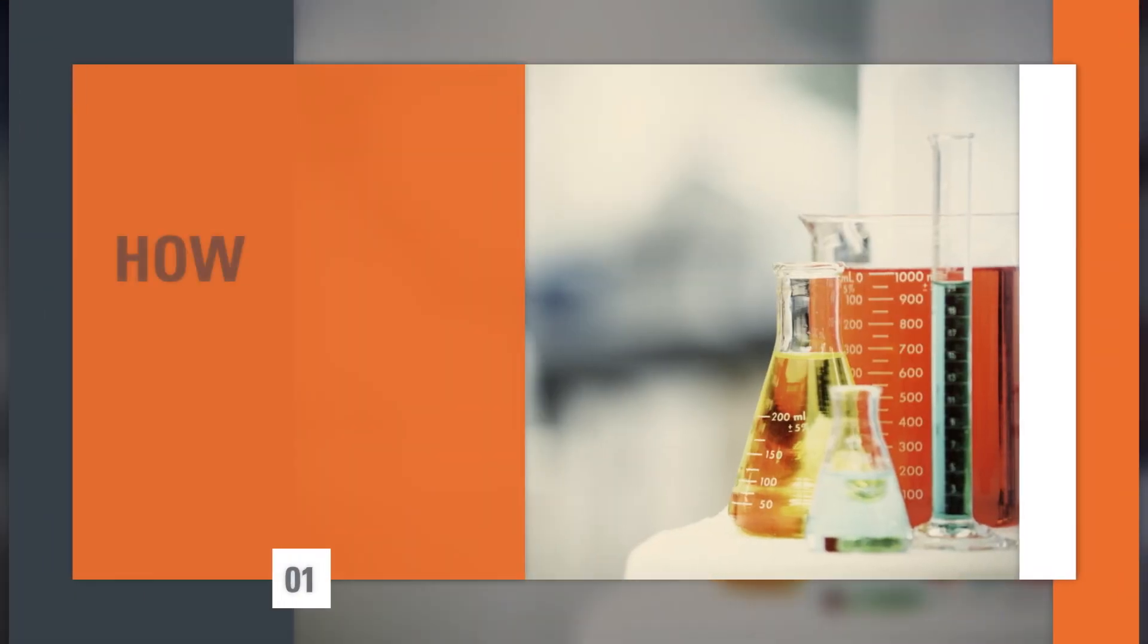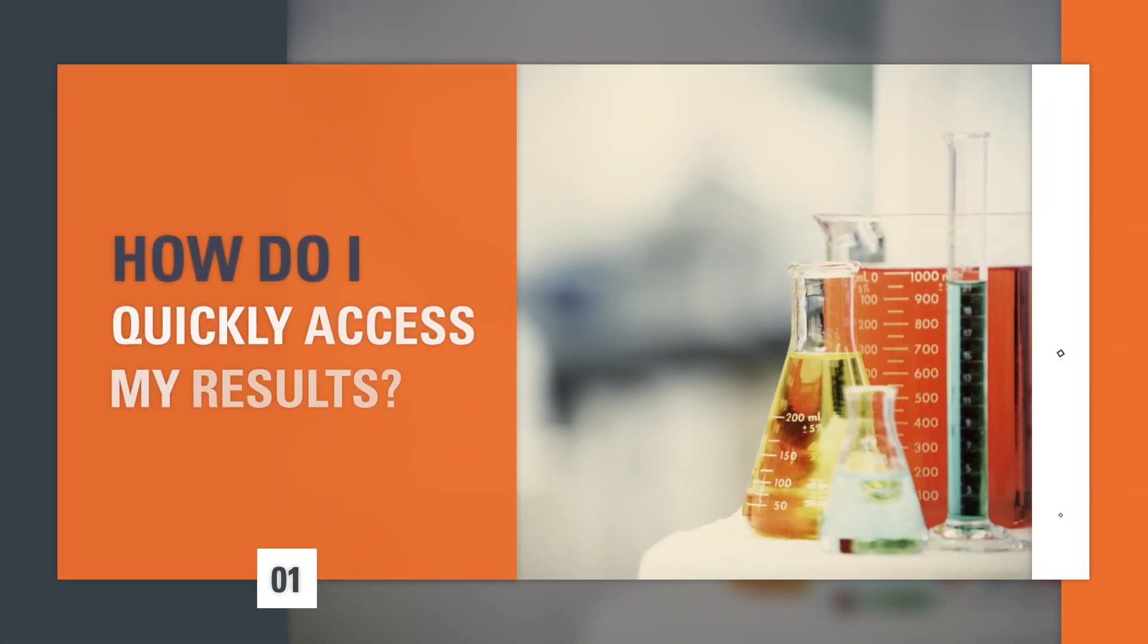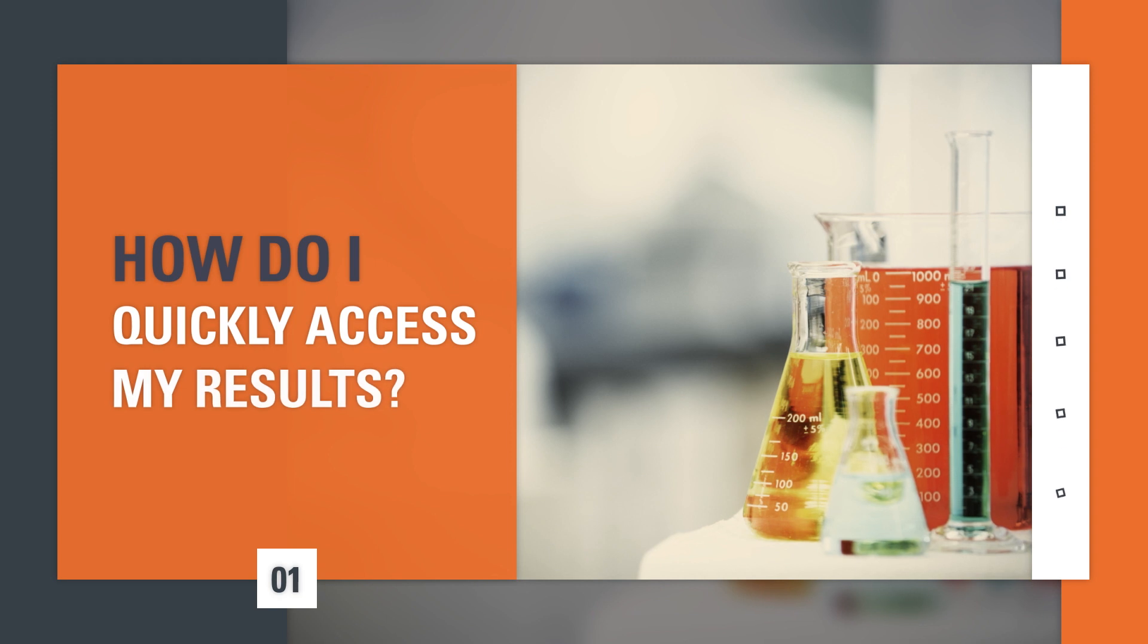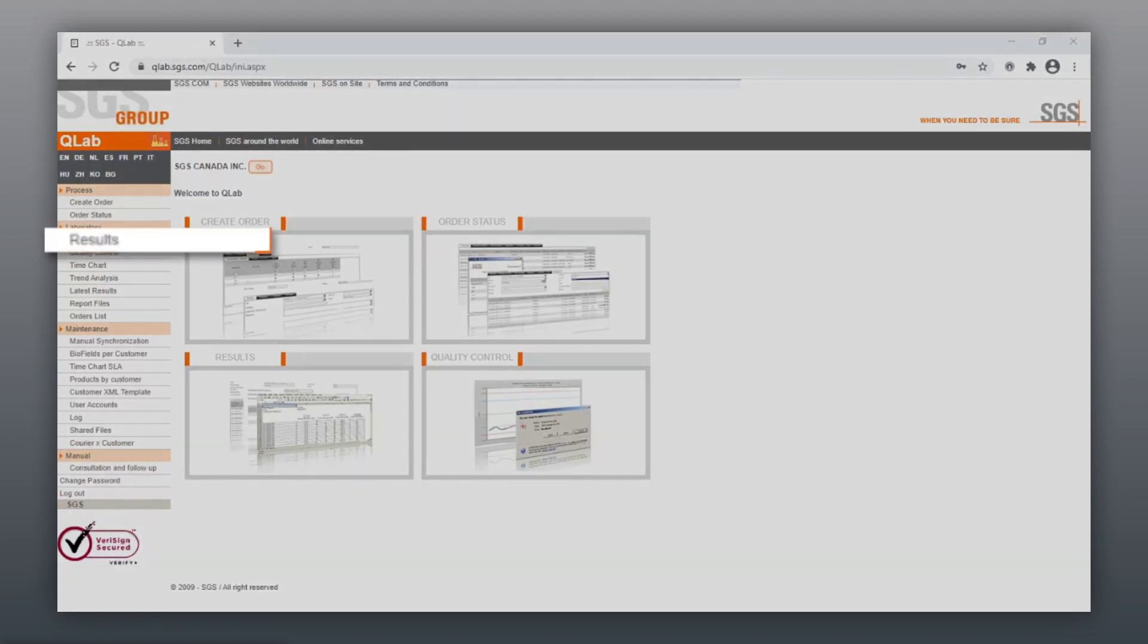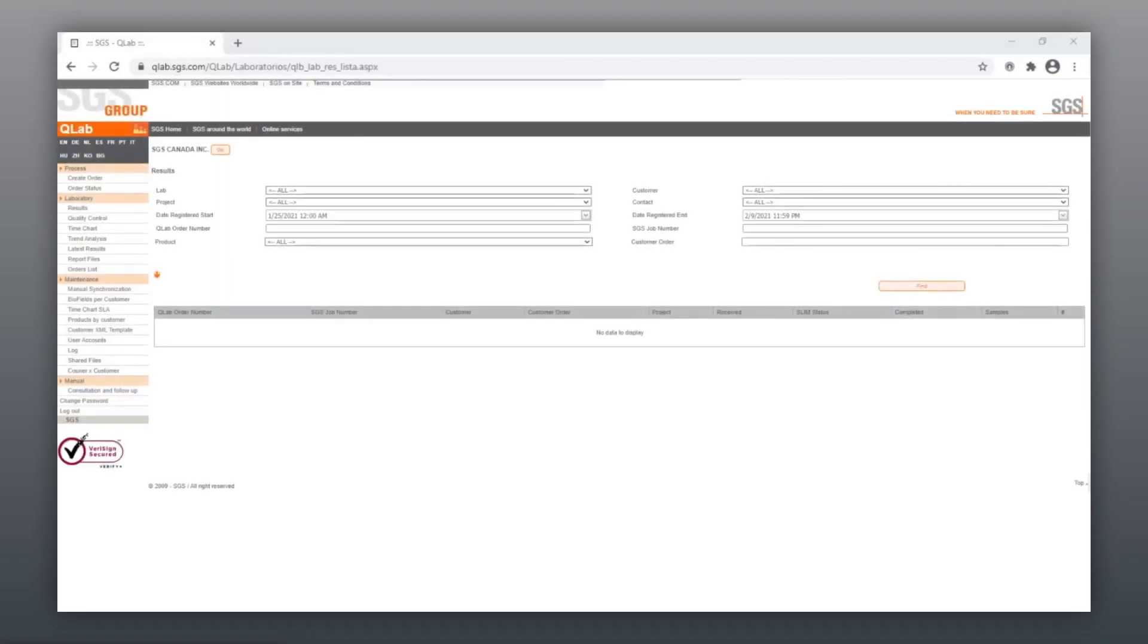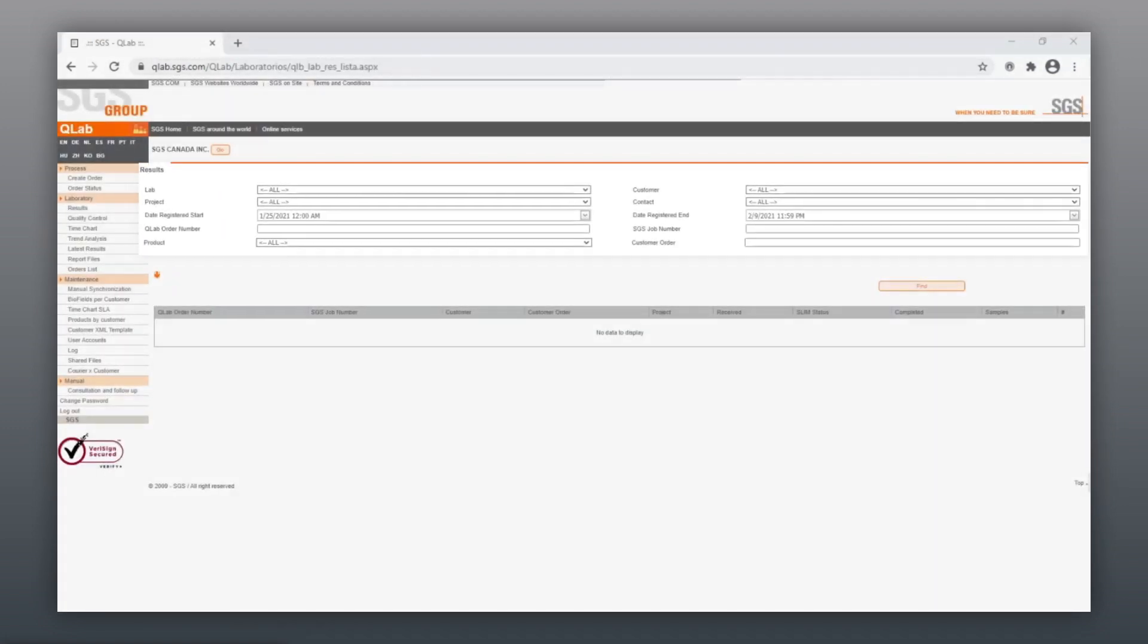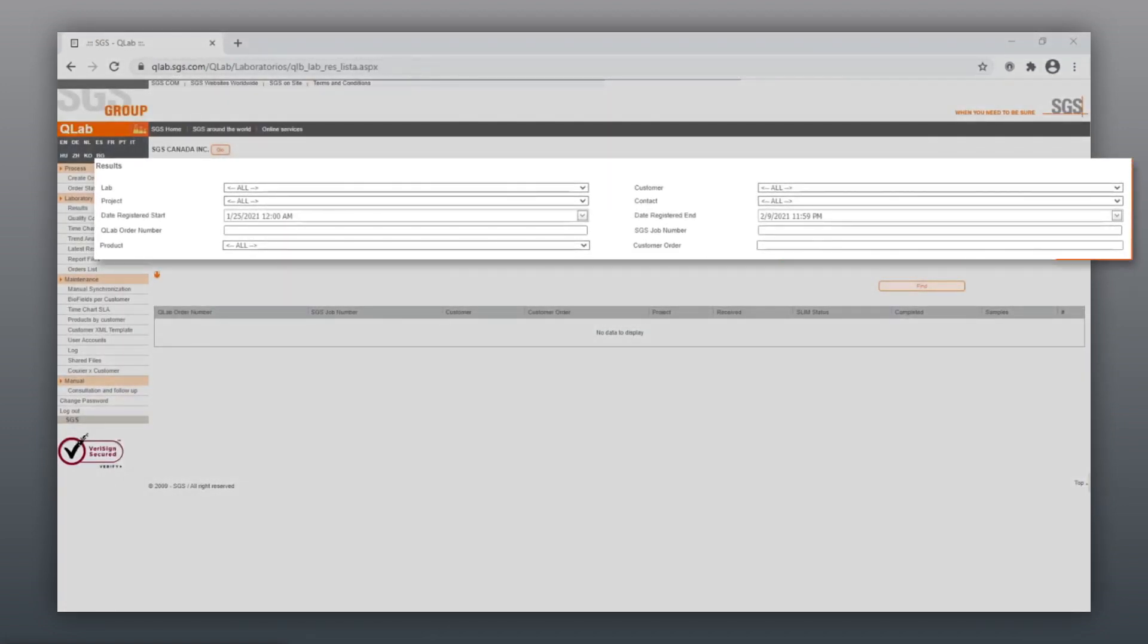How do I quickly access my results? When real-time access to data is your priority, go to the Results menu, enter your search criteria, and click on Find.